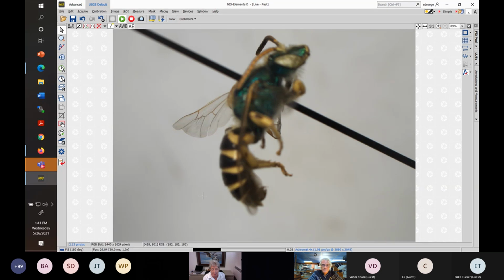As someone who often works in museums, they would have straightened that abdomen out. So again, that means that you could have several different possible measures of the length of this bee and be correct at the same time. So what do I do? In general, I don't do it on the microscope because it's too slow. I still use lengths because often within these large groups, the length of the bee at the extremes, very large, very small, is useful in separating out things. And in Dufourea, I do it all the time because there's a huge range in sizes. So I almost always measure the length.